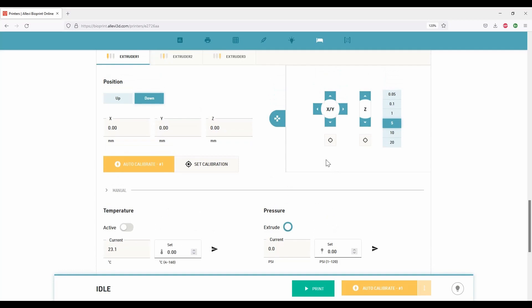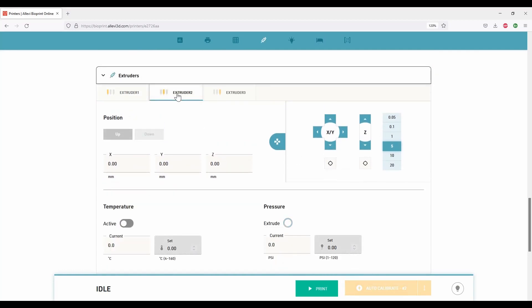Repeat the process if you are working with multiple extruders. Select the extruder and move along X, Y, and Z axis.